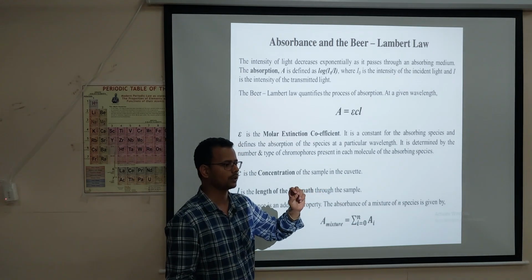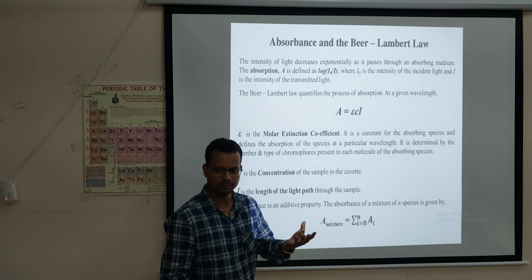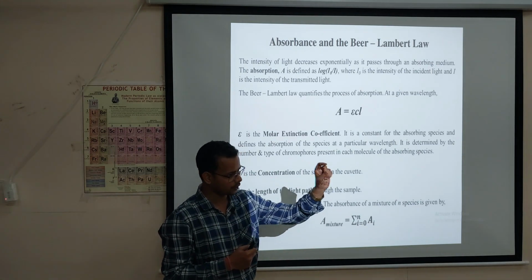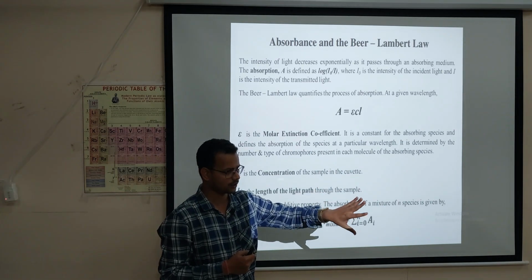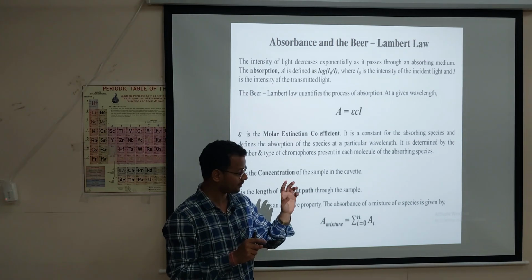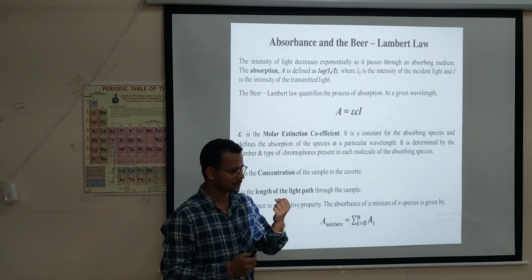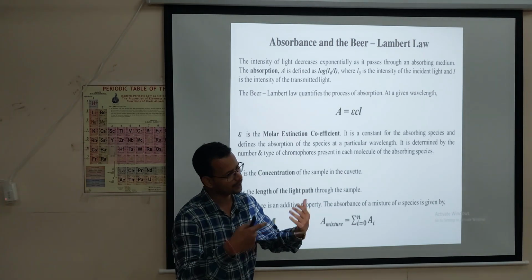Suppose we do it for different concentrations, 20 ppm, 40 ppm, 100 ppm, 50 ppm. First we get the epsilon value from the UV visible spectrophotometer, right? And by putting that epsilon value, we get how much concentration of the substance is present in the solution. We get the epsilon value from UV visible DRS spectroscopy for the parent material, and then for different concentrations it will remain constant.